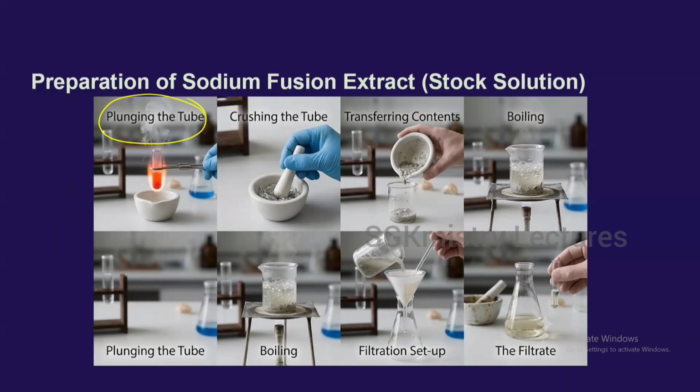After it is added to the mortar, you're going to crush the tube using the pestle. So this is the pestle. I hope you all know this is the pestle, and this is the mortar. So you're going to crush.